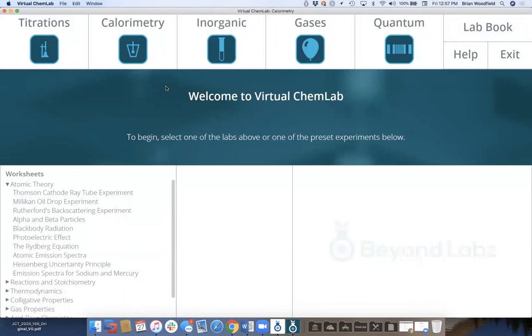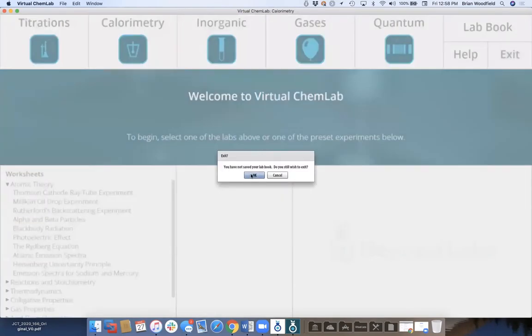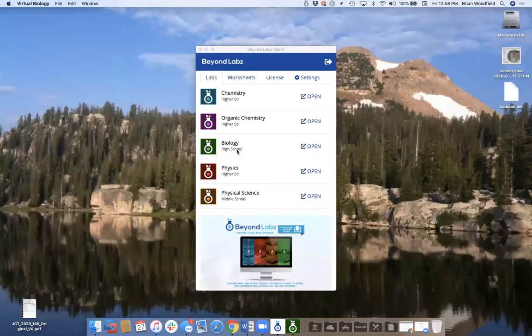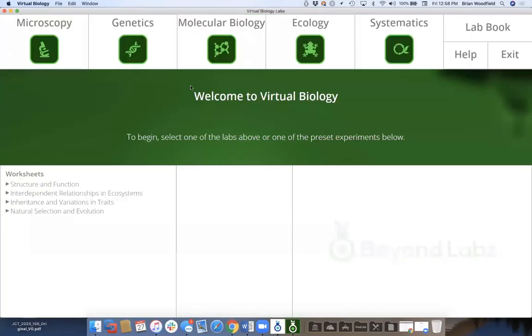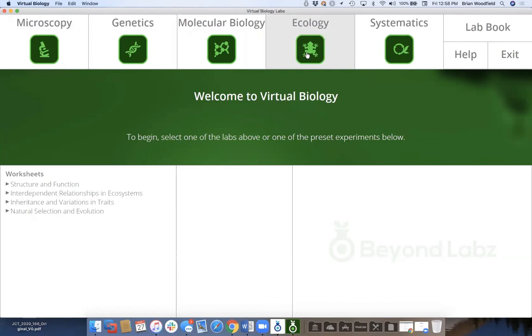After a whirlwind tour of three products, let's dive into molecular biology as requested. We have five different benches in biology: microscopy, genetics, molecular, ecology, and systematics. The whole idea in this lab is a virtual world full of about 175 species with genomes, genetics, and 3,500 images. You can have them interact in ecology and see how populations change. In the molecular biology lab the whole idea is to amplify certain genes.